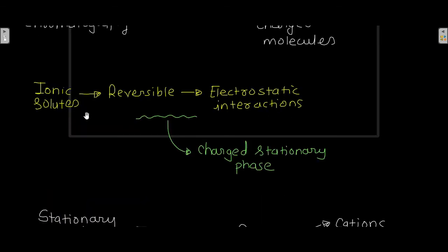Now in this technique, the ionic solutes display reversible electrostatic interactions with the charged stationary phase.